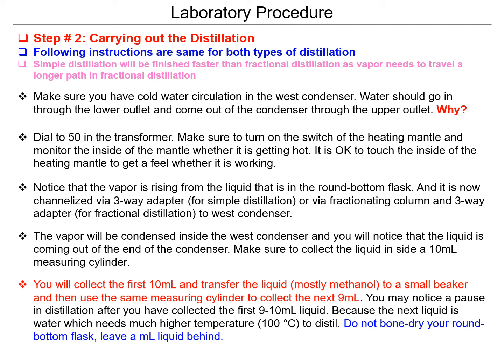However, as students, you should learn the experiment slowly and appreciate the technique, so I may recommend you carry on the experiment rather than stopping it. Once you collect the first volatile liquid, you can continue the experiment to collect the second liquid. In doing so, you need to exchange the measuring cylinder for a new one so that you can collect the second liquid in a separate container.